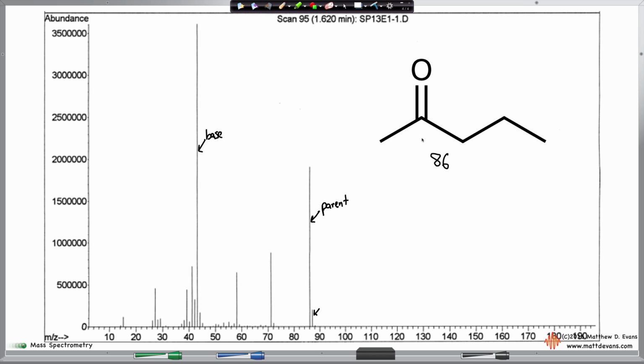Well, most of an organic molecule contains the isotope carbon-12. That's the predominant carbon isotope, about 99% of a given molecule. The other isotope is carbon-13, roughly 1%. And remember, carbon-13 is 1 atomic mass unit heavier than carbon-12, and hence we see this smaller peak.